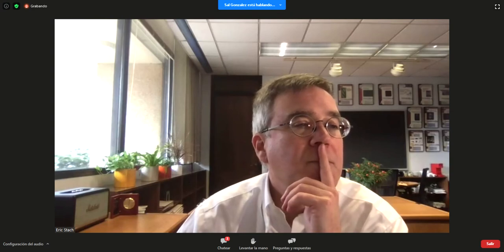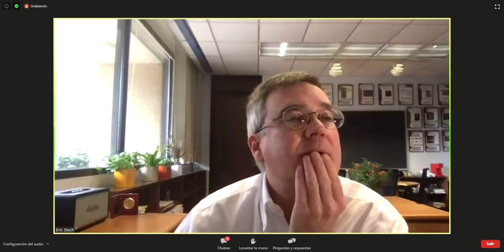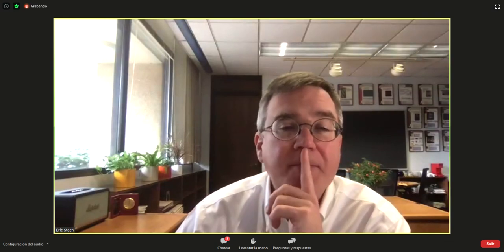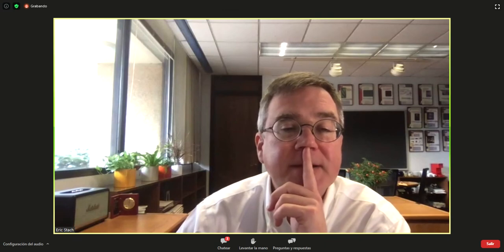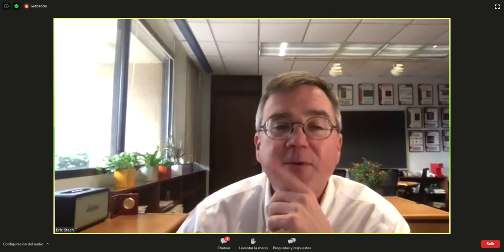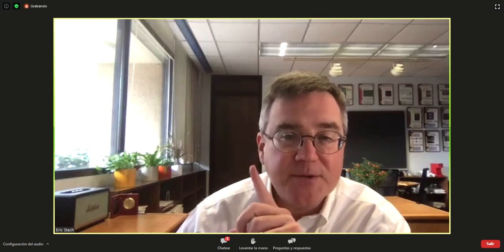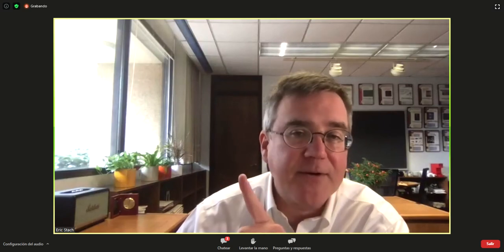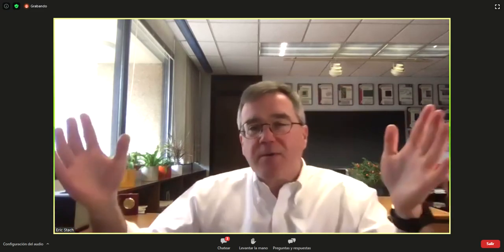And for those of you in the United States, no, I'm sorry. So I do now that I see there's this Q&A. There's 2 quick ones that I think I'm going to do real quick. So Tony asked, width of view meaning field of view. Just to clarify, you can go as low as 50 times magnification and as high as 15 million. So the field of view is highly variable just depending on the magnification that you choose. So you can look at things microns wide, and you go to things at the angstrom scale.